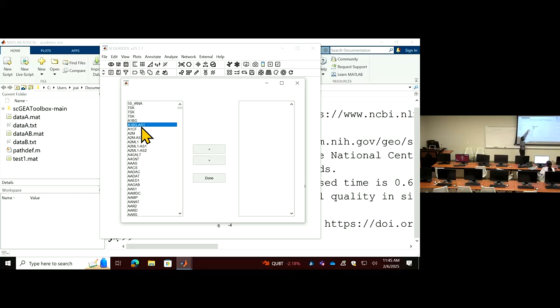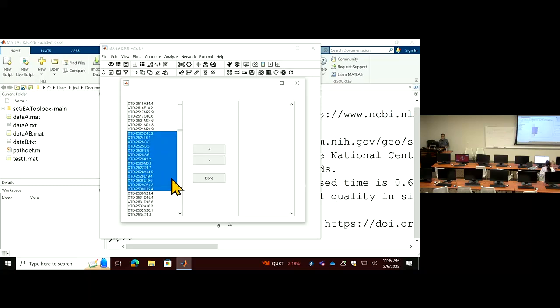So those genes, for example, these RNA genes, you don't want to include them because they have a different transcription machinery. They are very different from protein coding genes, or you can remove them. At least you should have a strong reason to keep them. Some genes, I don't know whether this is officially named, are open reading frame genes. People just put annotation in there, but there's no related function.